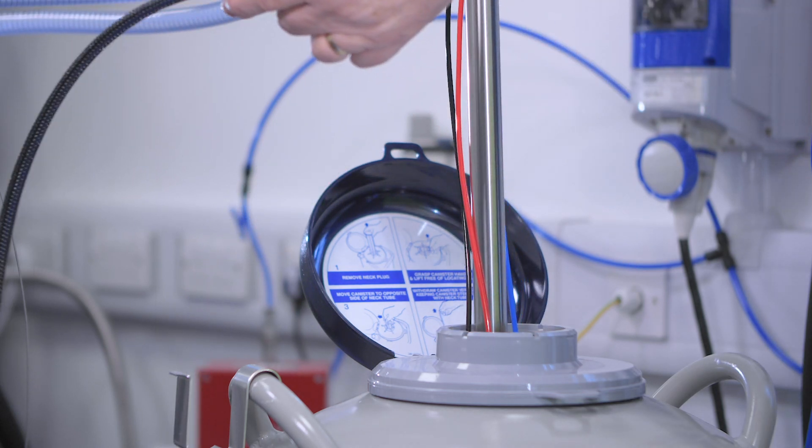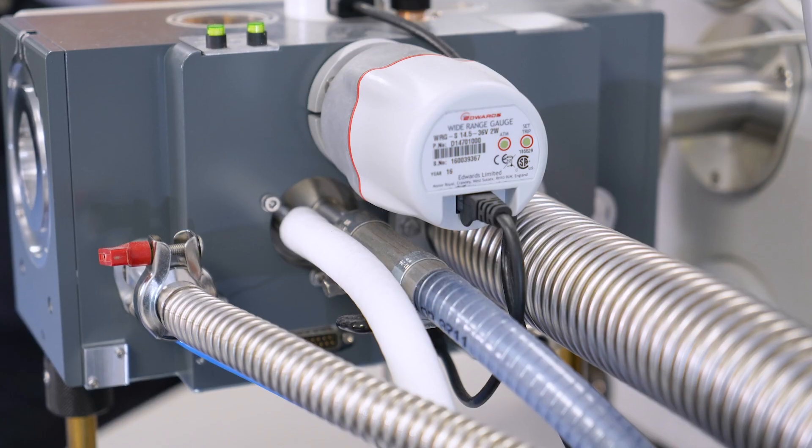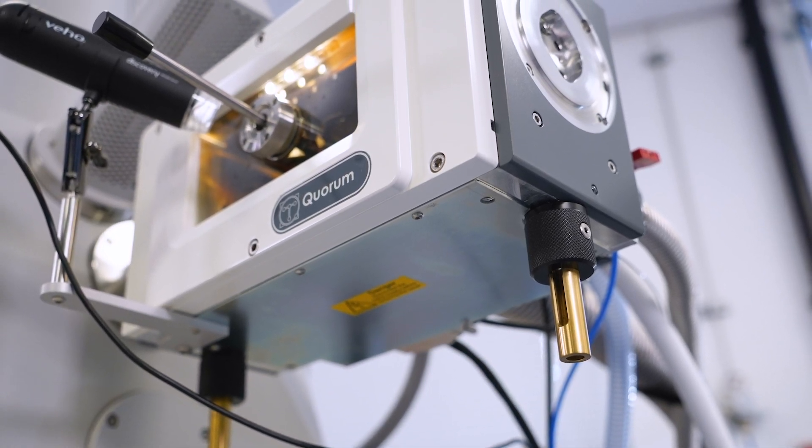With braid cooling, there is a huge amount of copper to cool down, taking up to three hours. There is a huge inertia, so changing the temperature is very difficult and warming up also takes a long time. You also have to be very careful routing the braids within the microscope chamber because if they touch anywhere you get a huge heat leak. With gas cooling, the plastic tubes can touch anywhere in the microscope with very little effect on the final temperature. Additionally, braid cooling requires the Duo mounted on the column, which limits hold time, whereas off-column gas cooling lets you run for days.